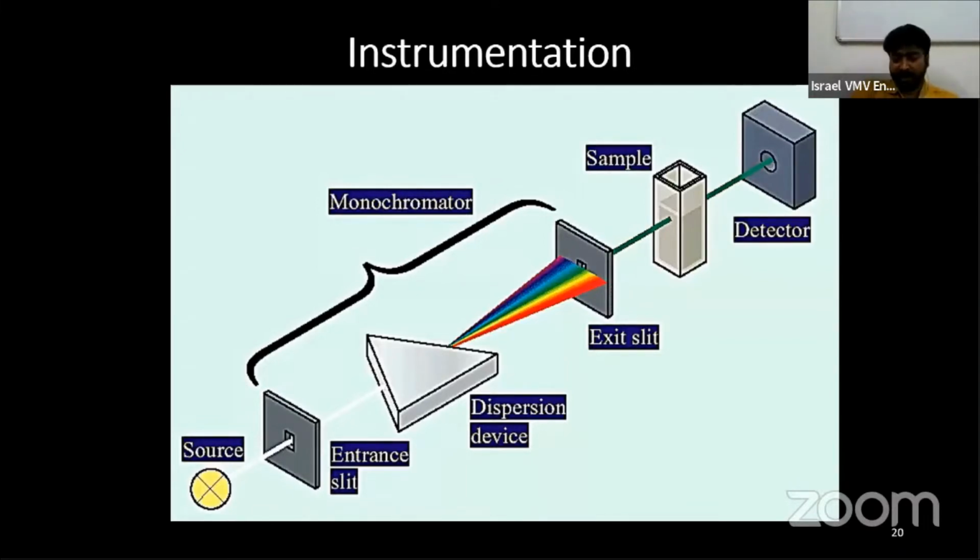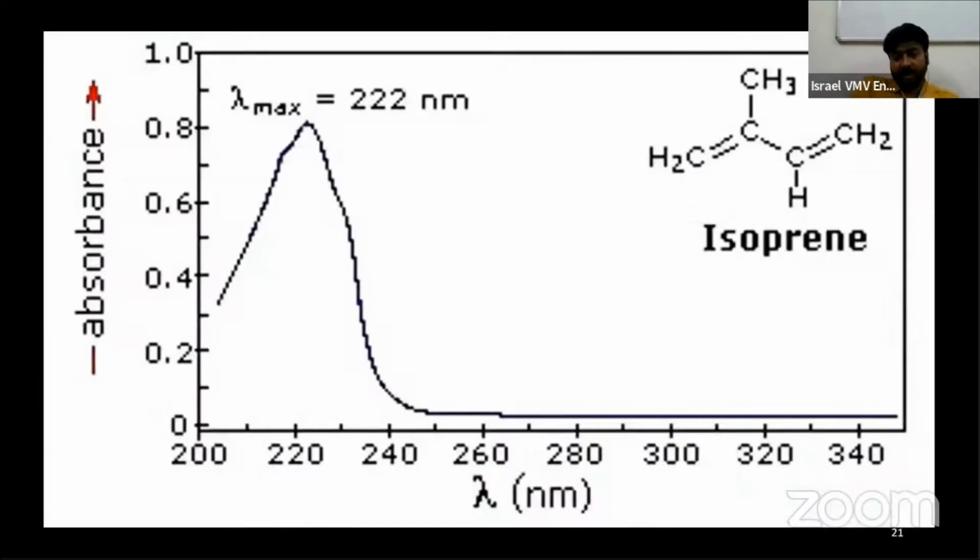These are all instrumentation, you know, you obviously can understand. I talked about the difference between the absorption spectrophotometer and the fluorescence spectrometer because people are often confused, right? And I talked about the various excitations.